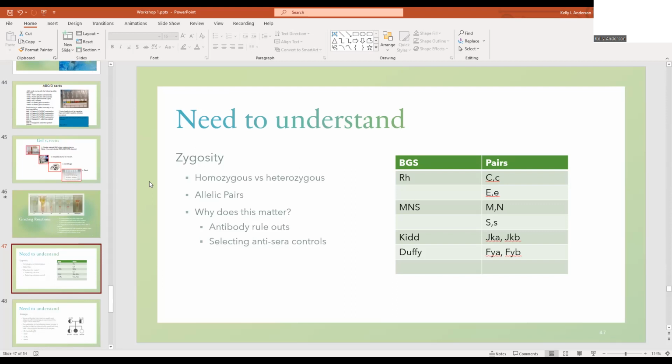There might be both, but it will say on the vial what is in it. So that has both IgG, and that one is good and they're ready.